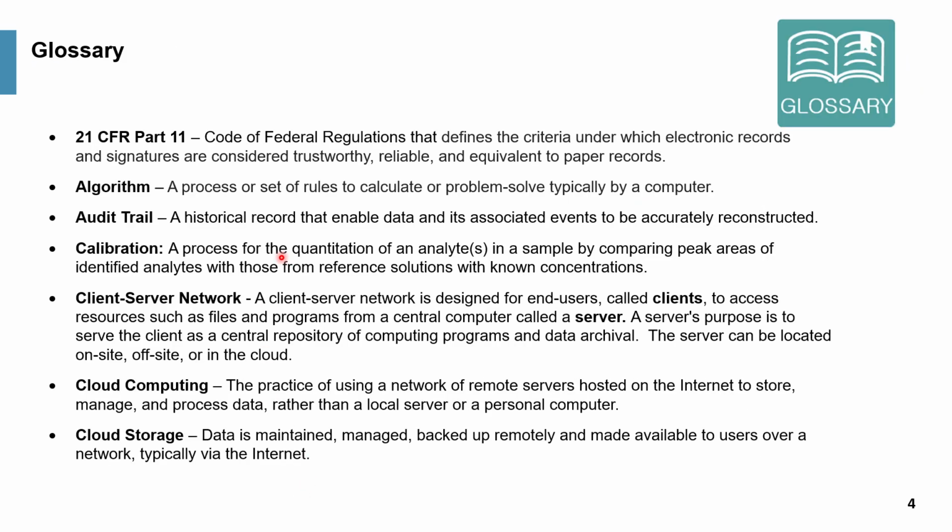Okay, this is the glossary of terminology. Would not comment too much. 21 CFR Part 11, CFR stands for Code of Federal Regulation, that defines the criteria for electronic record and signatures, and make sure they are traceable, trustworthy, reliable, and equivalent to paper record.